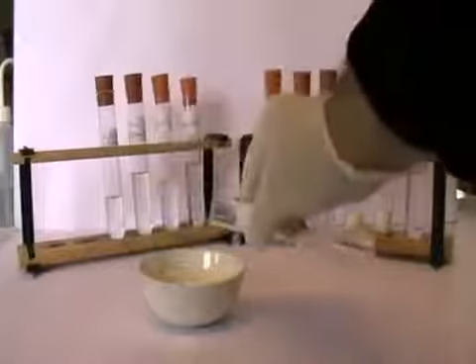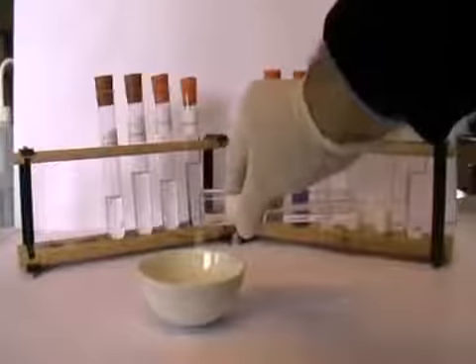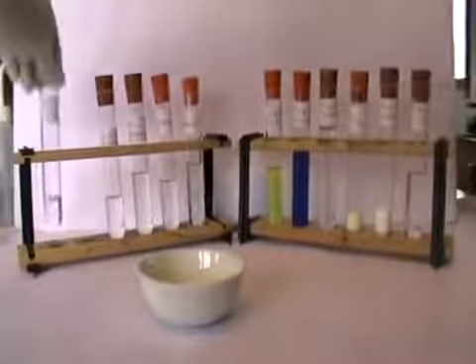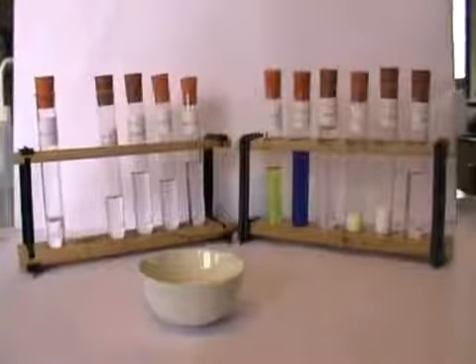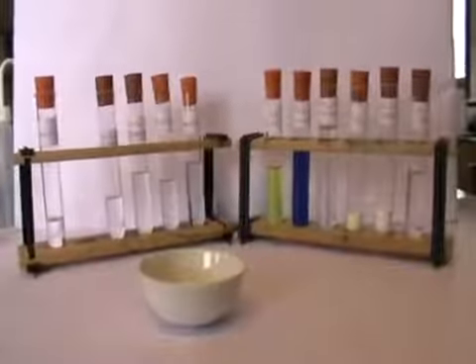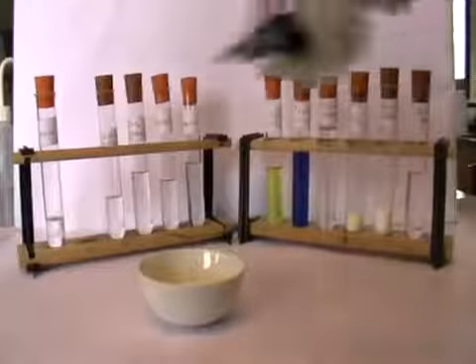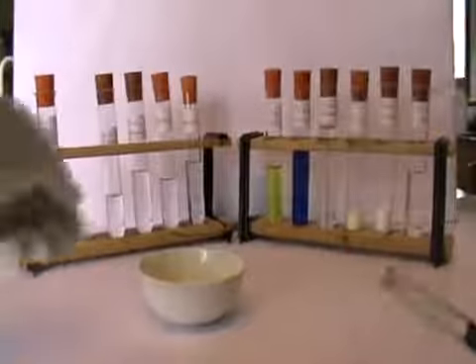I'm going to pour a little bit of this colourless clear liquid ethanol out into an evaporating basin. And we've got to be careful here with flammable chemicals. So I'm being very careful with my source of ignition, and you'll notice that we have stoppers on all the other chemicals here.